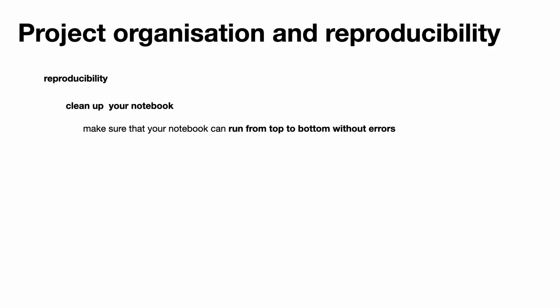And this is a really nice source of error that in the end will really cause confusion, especially if you try to look again at your notebook and see what you did at some point. Jumping from bottom to top cells and changing things will lead to this confusion because you can't really reproduce what you did at some point.